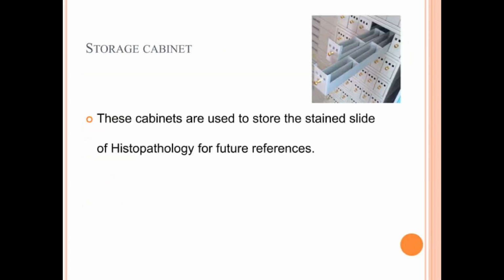A storage cabinet in histopathology is used to securely store prepared tissue slides, paraffin blocks, and other important lab materials. These cabinets are designed to protect samples from environmental damage, such as dust, moisture, and temperature fluctuations, ensuring their integrity for future analysis.